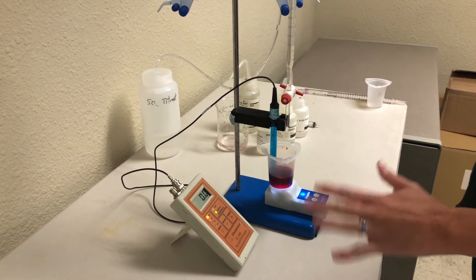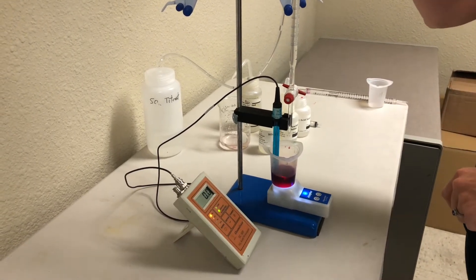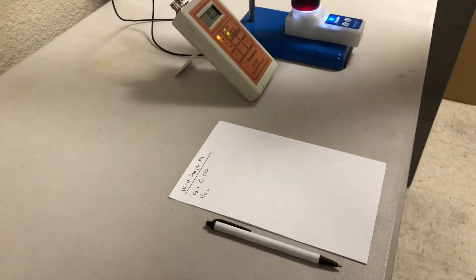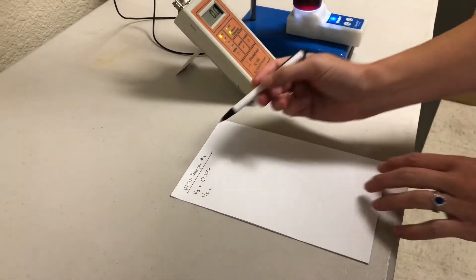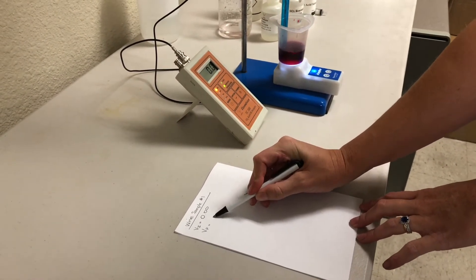My units read 0, which is good. That means I'm ready to run the test. I've made a note of my starting volume on my burette, which is 0, and I'll want to record the final volume once I've completed the titration.